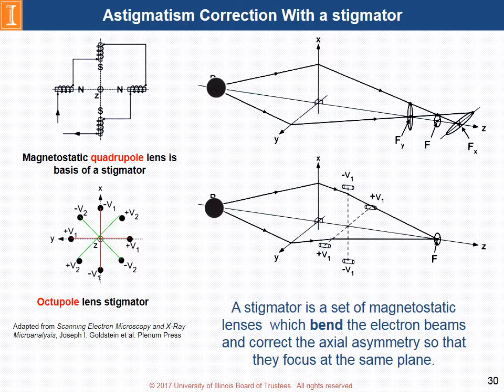That is, the source needs to be highly demagnified. Before astigmatism correction, depending on the objective lens focus, the probe shape changes from oval to round and to oval again. The point here is, even when the probe is round, the probe is still not highly demagnified as we would hope.